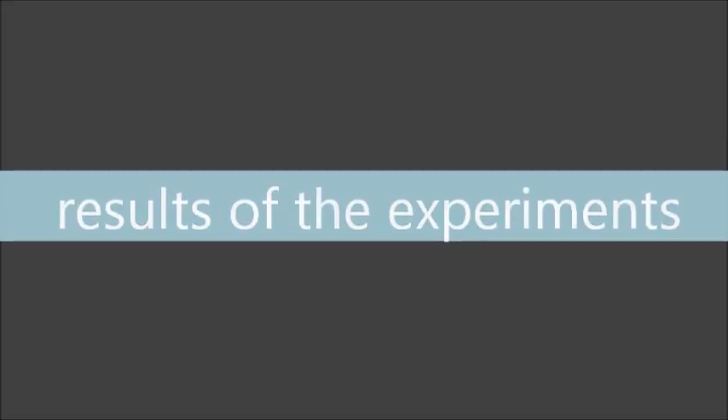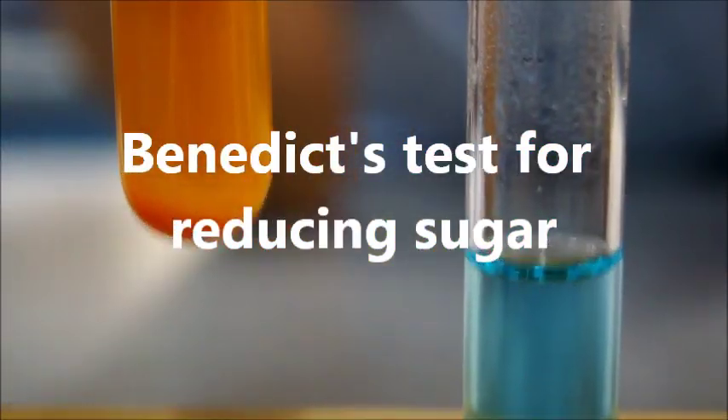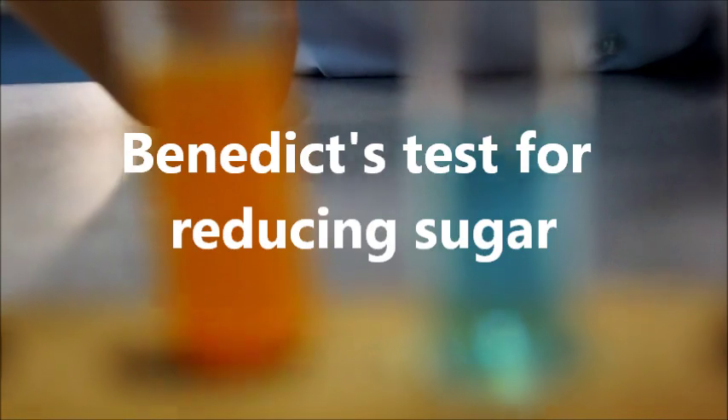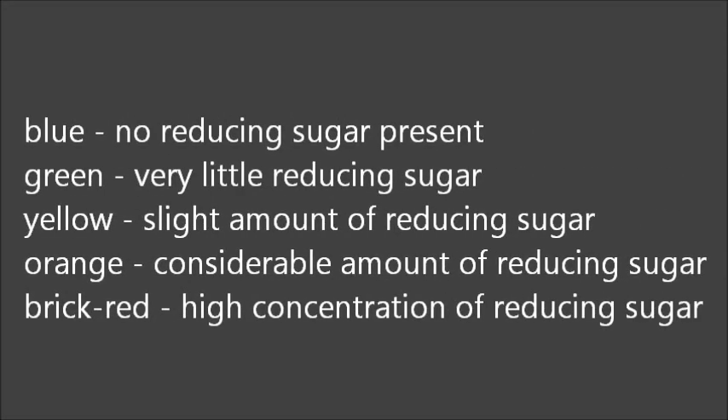Results of the experiments. Benedict's test for reducing sugar: Blue — no reducing sugar present. Green — very little reducing sugar. Yellow — slight amount of reducing sugar. Orange — considerable amount of reducing sugar. Brick red — high concentration of reducing sugar.